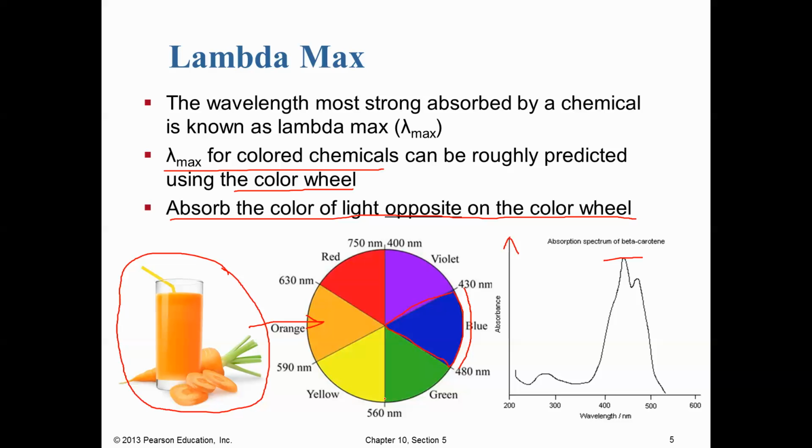So that's where we're absorbing the most light. And our horizontal axis here is our wavelength of light in nanometers, and we're often working in nanometers because that's in our visible range right there. And what we see is if we draw a line down, and if we had a computer axis, we could actually measure this much more accurately.